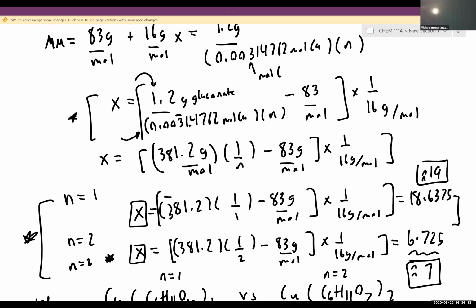In the earlier attempts, I was trying to get a nice, clean algebraic solution without guessing, but this is one of the few empirical formula problems where they want you to guess values of n, just to make the math and the algebra less tiresome. Would everyone feel comfortable using this equation that I put a star next to with their data?